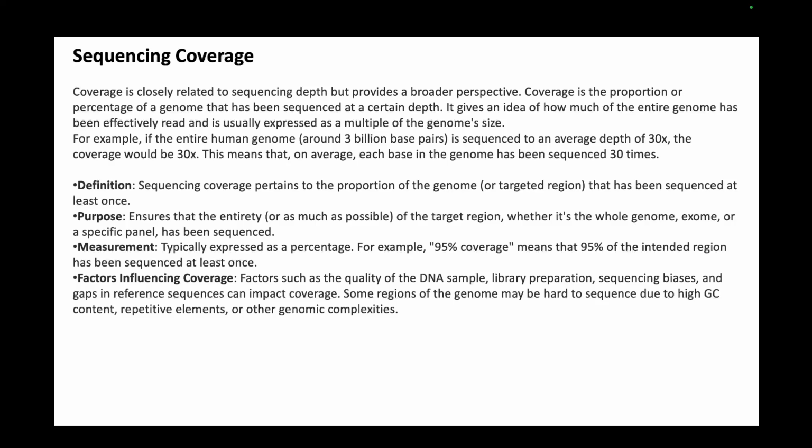So coverage will tell you if your whole genome has been sequenced or not, and if it has been sequenced, what is the average depth of the particular bases that have been sequenced. The concepts are very similar, sequencing depth and coverage, but coverage gives you a much broader perspective. They are very often used interchangeably, but you should know what each means.